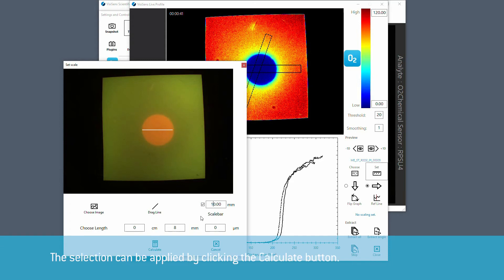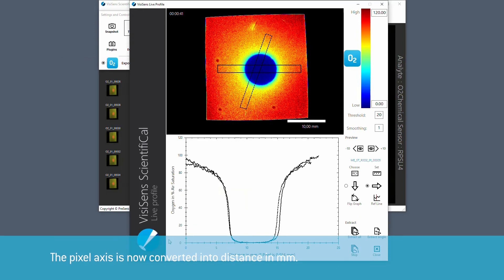The selection can be applied by clicking the calculate button. The pixel axis is now converted into distance in millimeter.